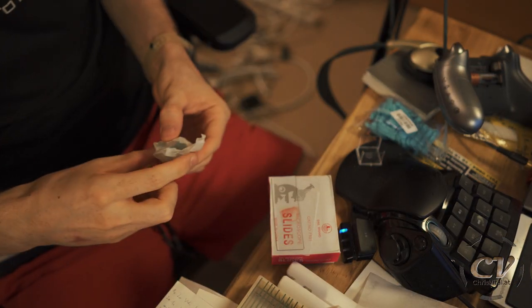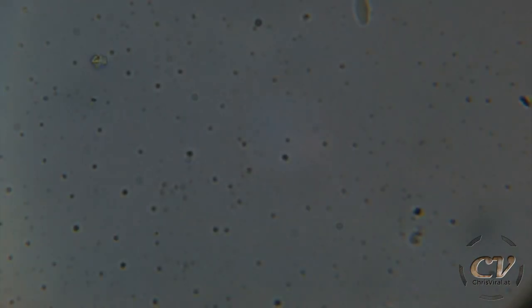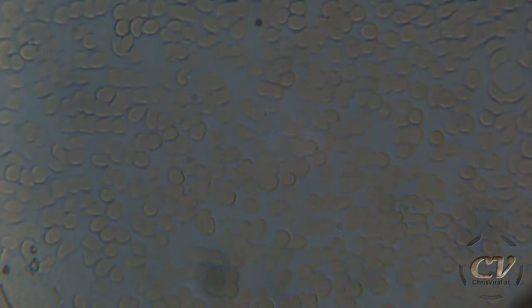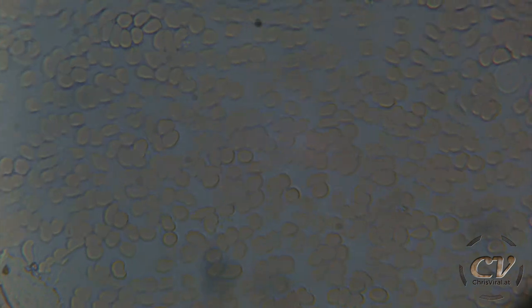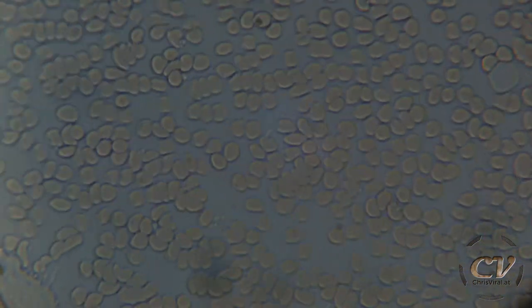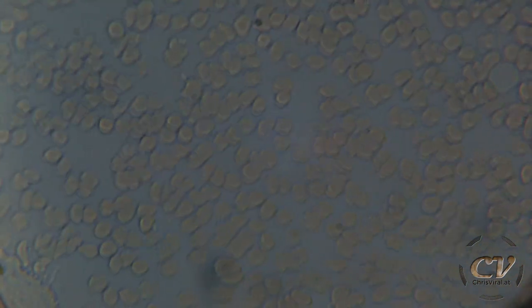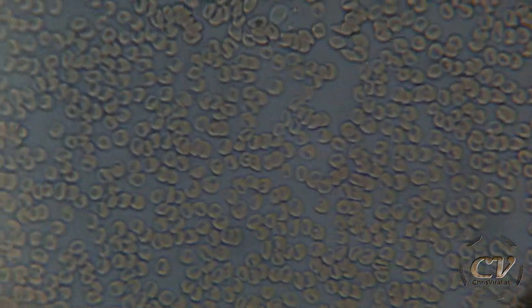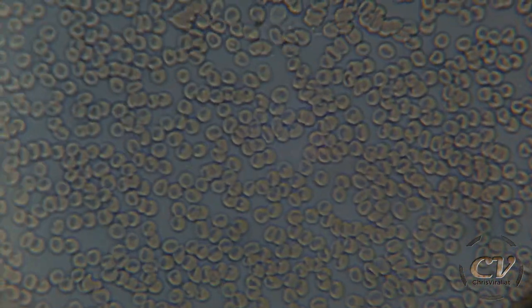Oh my god. Look what happened to this sample. So here we go. What the heck, oh my god, this is so crazy — stop! What the hell, are you kidding me? I am legit amazed. Wow, are you kidding me? This is so crazy. Why is it moving around so much? Like, where is it moving? It's just moving around — oh hell yeah!